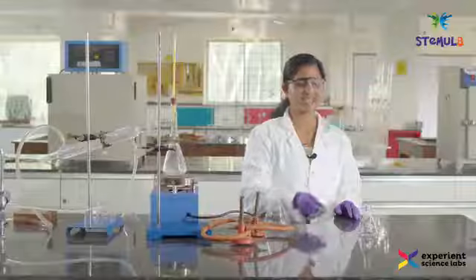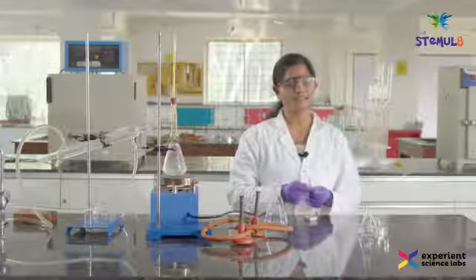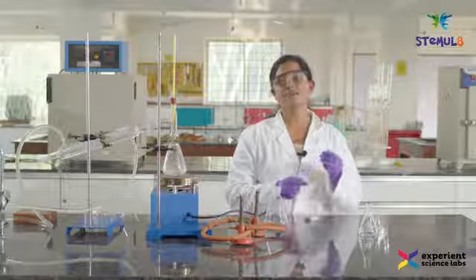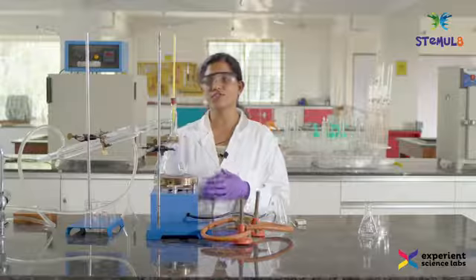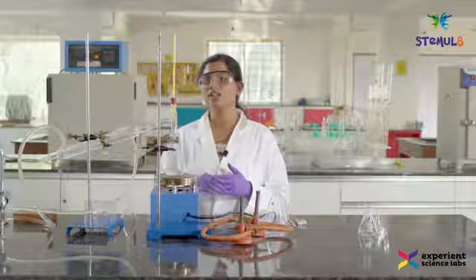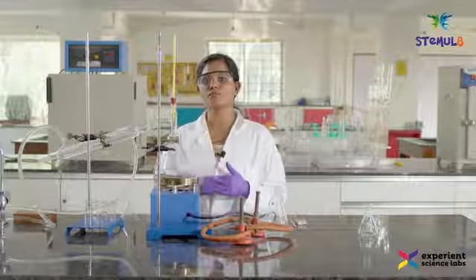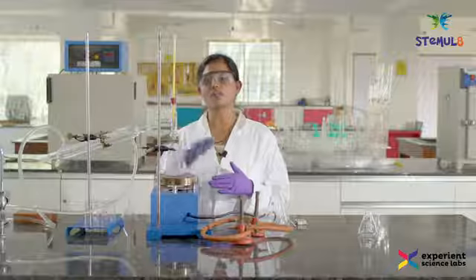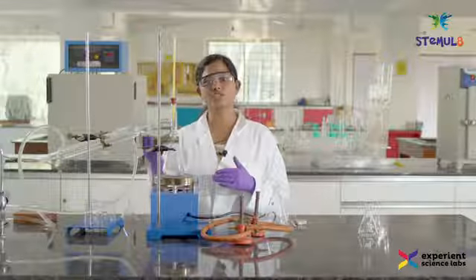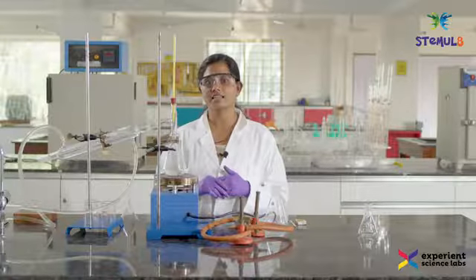Wow, this was amazing. Can you all just comment on what happened? If you know the answer, let me know in the comment section. To conclude, I have shown you the fractional distillation procedure, which was used to separate ethanol from water. This distillation process, or other complex distillation processes, are used in various applications and in large-scale industries.